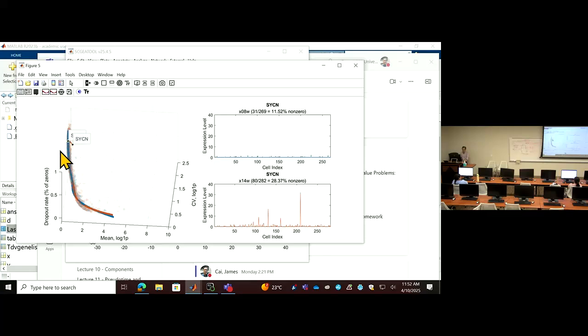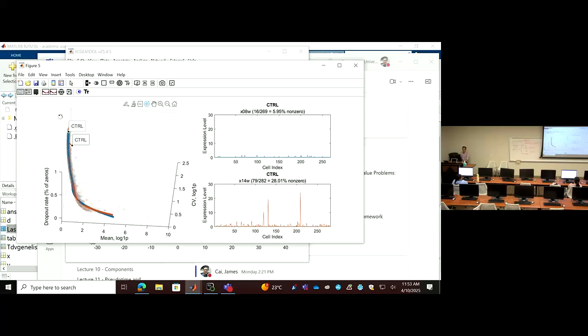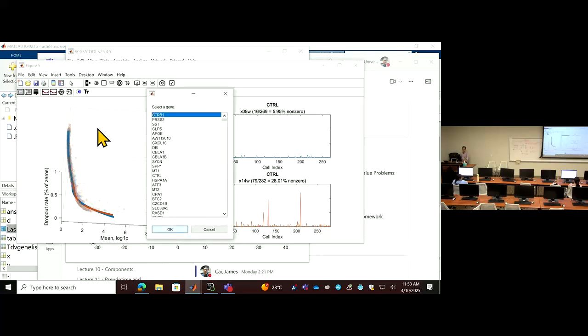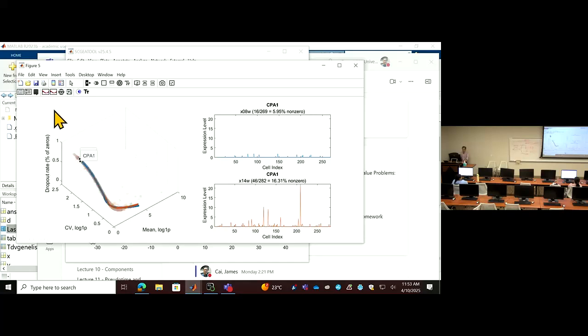These genes in two samples are all lowly expressed, but somehow in the orange, in this later stage, the variability increased. So you need some interpretation for those, depending on what cell type you are talking about. Also the direction. Write a small report on that.